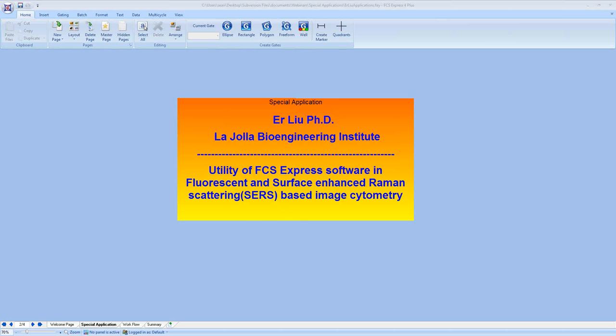So I just wanted to start today by telling you a little bit about FCS Express and maybe some of the reasons why Er has actually used the software to great results with his application. FCS Express has been developed as a powerful flow cytometry data analysis and presentation software. And we're proud that we've released our image cytometry product in the last year or two.